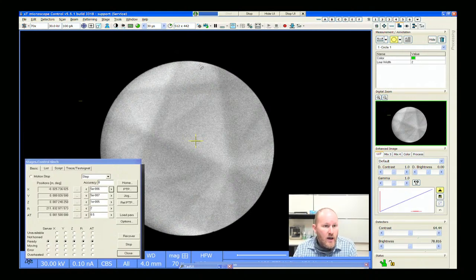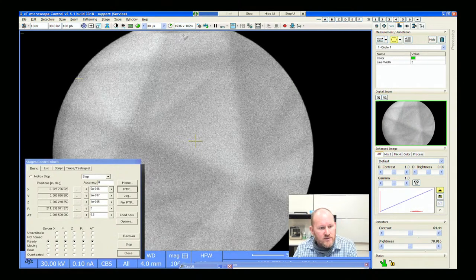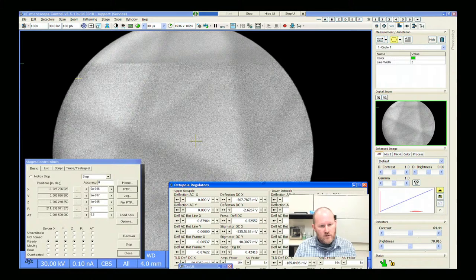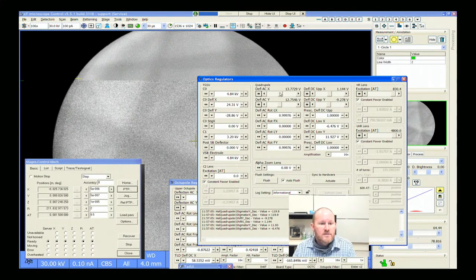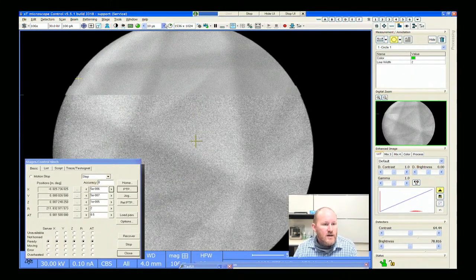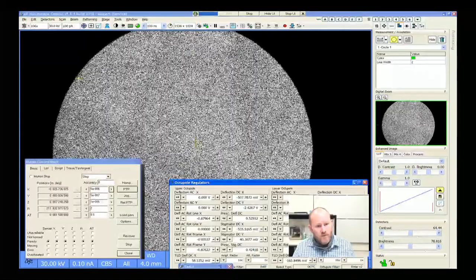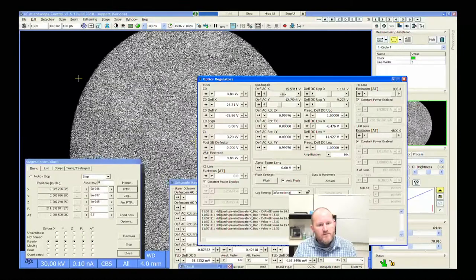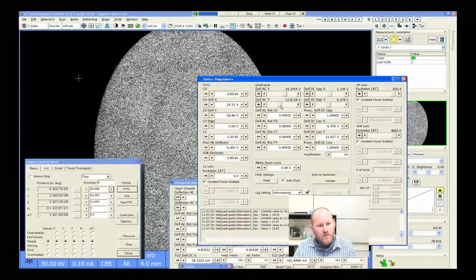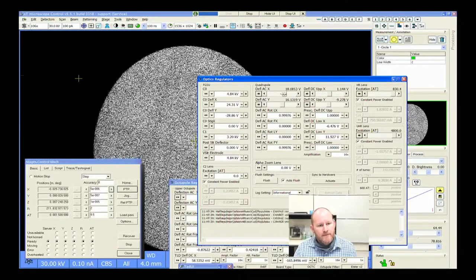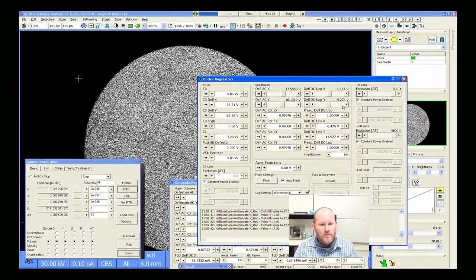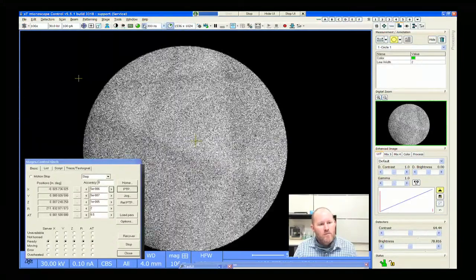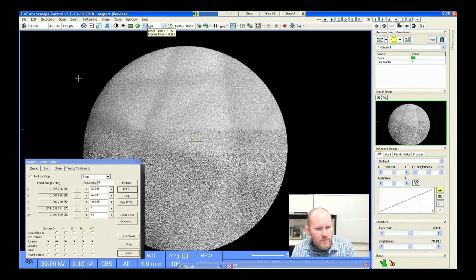We're at a 512 by 442 resolution. I can change the resolution — all I have to do is go to octopole regulators and increase the scan right here, just filling this single field of view. I can move these values up, up, over, down. So we have a way of making a higher resolution SACP.